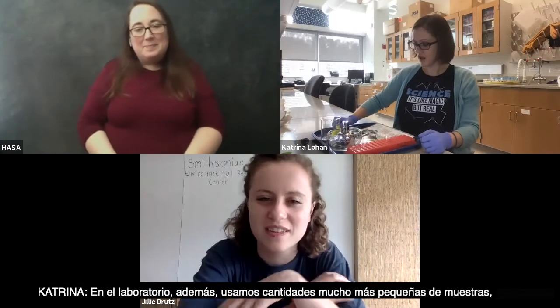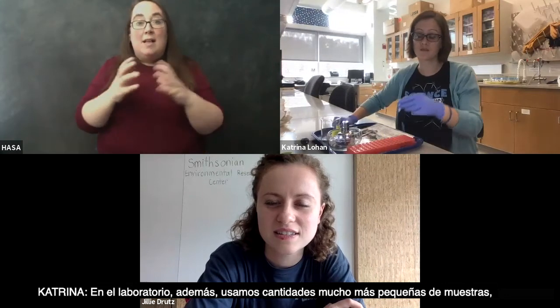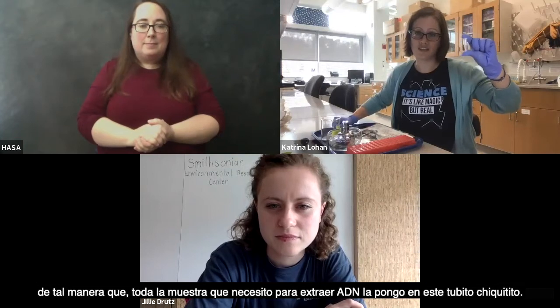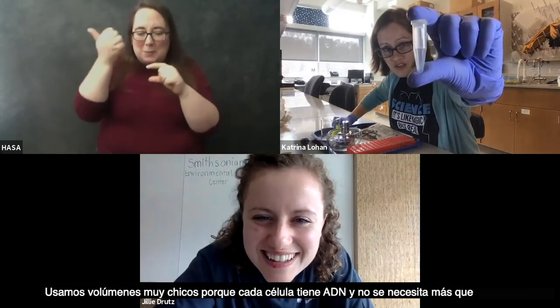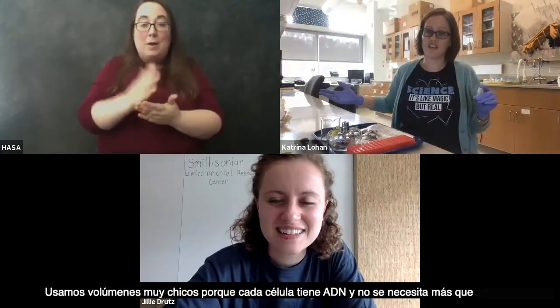You're welcome. We also use a lot smaller amounts. I will put all of the ingredients that I need to extract DNA in this teeny tiny little tube. We use really small volumes, and that's because, as we were talking about, every cell has DNA.